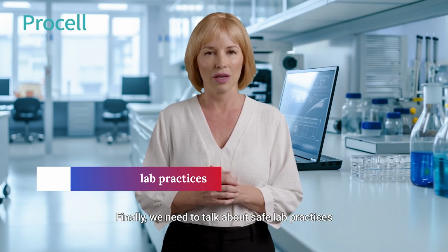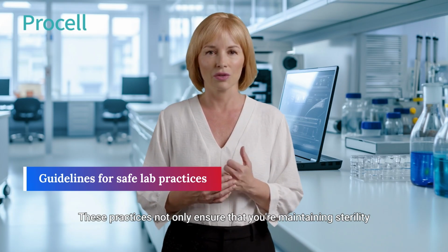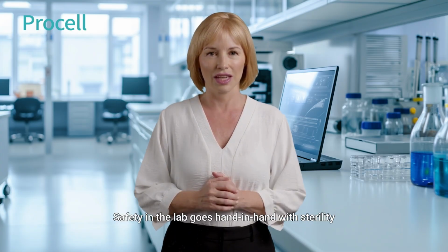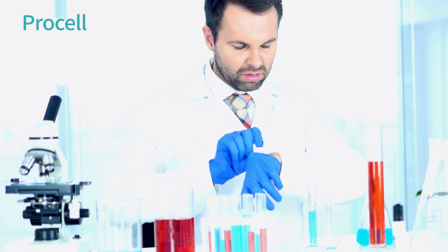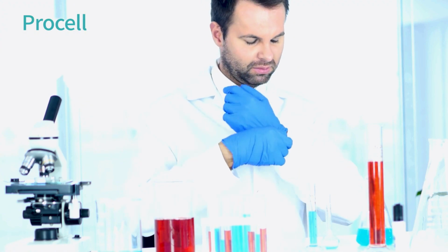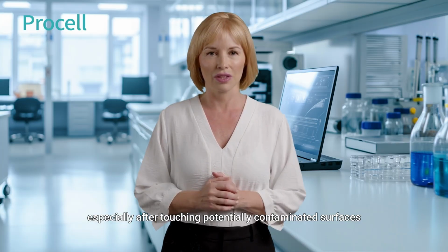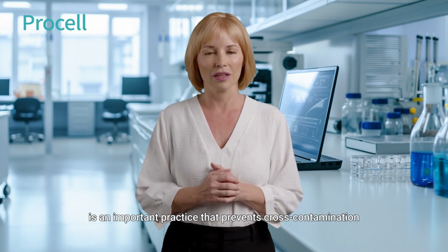Finally, we need to talk about safe lab practices. These practices not only ensure that you're maintaining sterility, but also that you're working in a way that keeps both yourself and your colleagues safe. Safety in the lab goes hand in hand with sterility. Wearing the proper personal protective equipment is essential, not just for keeping your work sterile, but also for protecting yourself. This includes gloves, lab coats, and safety goggles. Changing gloves regularly, especially after touching potentially contaminated surfaces, is an important practice that prevents cross-contamination.